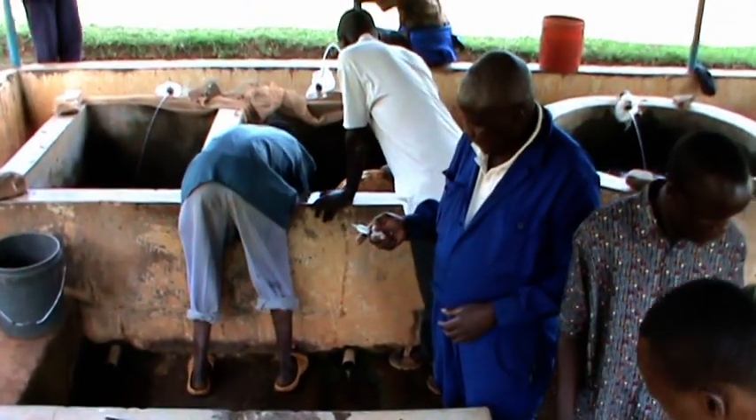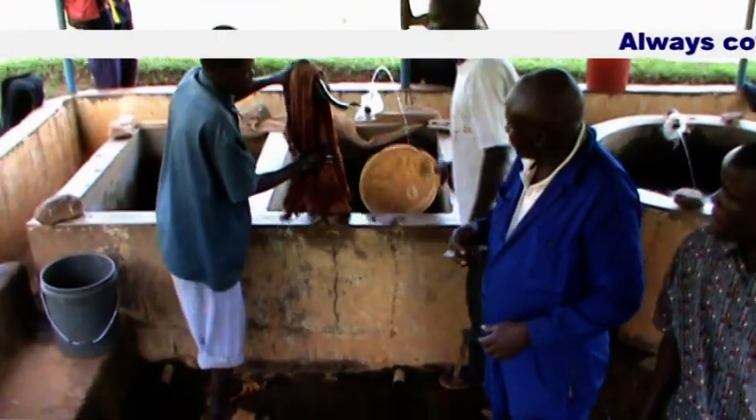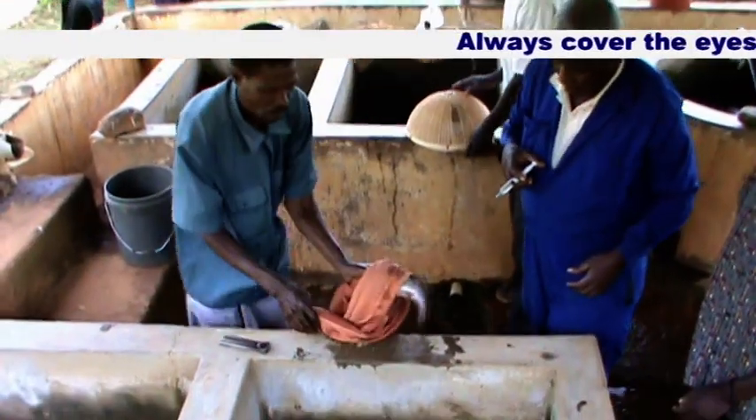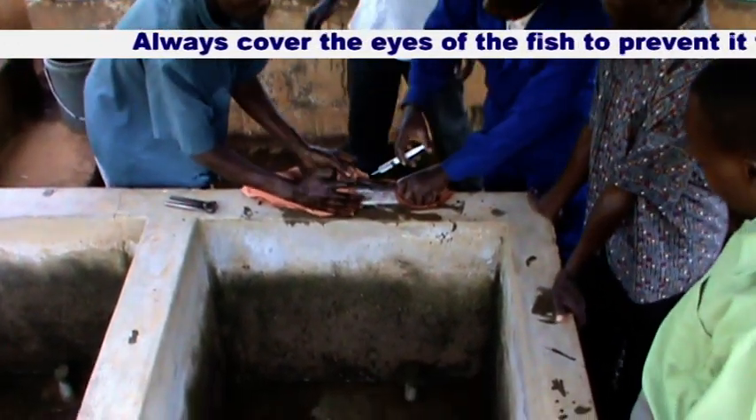Remember, when handling the fish, it is always advisable to cover its eyes. This ensures that it does not struggle during the handling.